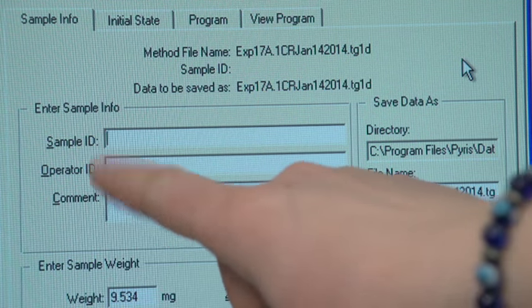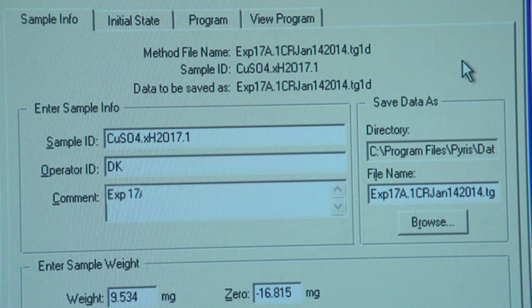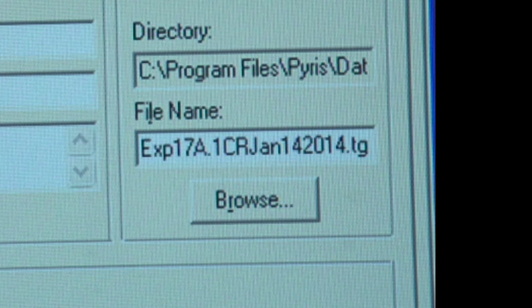The sample ID is the chemical formula of the hydrate under investigation. The operator ID is both partners' initials. Under the comments section, enter experiment 17A and the day's date. Under the file name, fill out the experiment number, your initials, and the date.